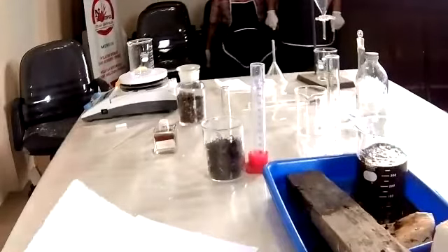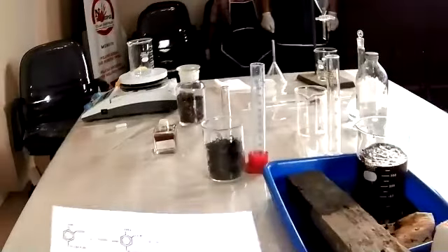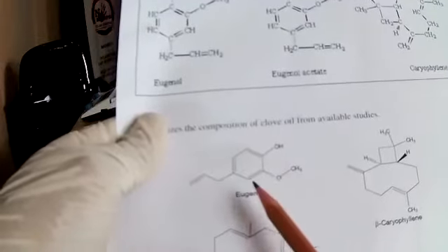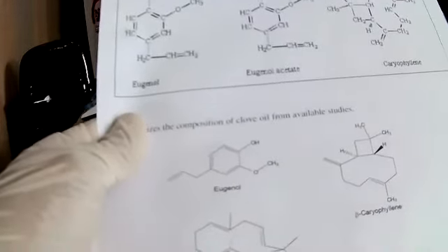And these are the compounds in clove or the clove extract. We're going to show you how to extract eugenol from the clove ingredients that we have here. Because eugenol here is the anti-fungi, the anti-insect, and anti-mold, and this is what we want to have. This is the property that we use for the conservation.